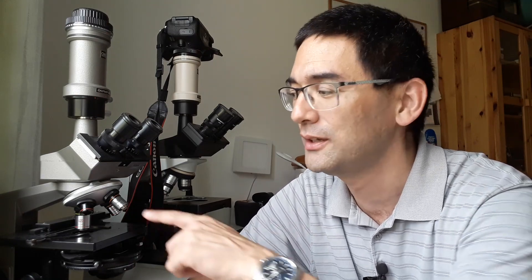And third answer is the following. Probably there are other factors that have a significantly higher impact on image quality than the objective. How well is your sample prepared? Is there any dust or dirt somewhere in the light path? This can have a significant impact. The setting of the condenser, maybe even the camera itself, the dynamic range of the camera might have a strong impact. So there are many many other factors that can influence image quality.